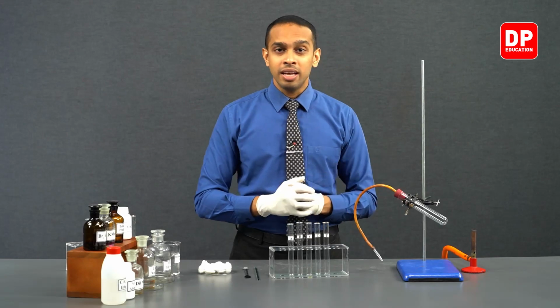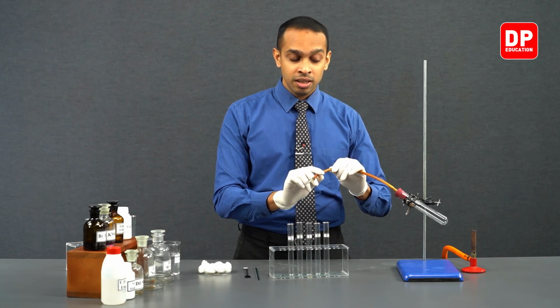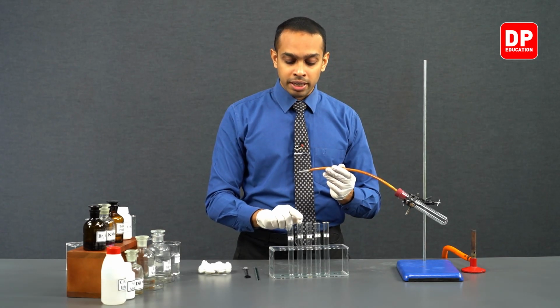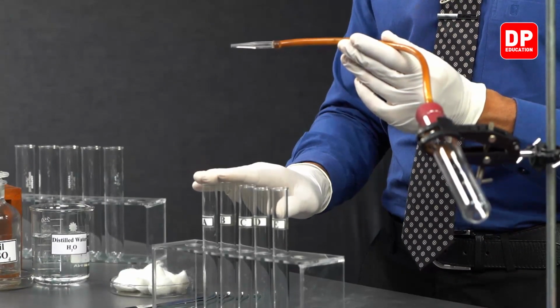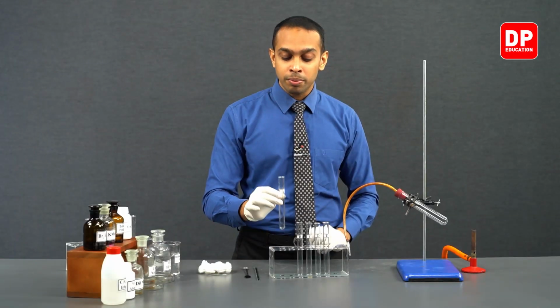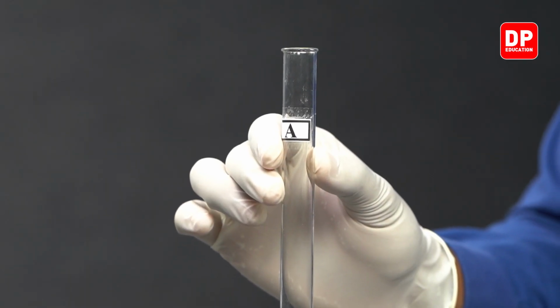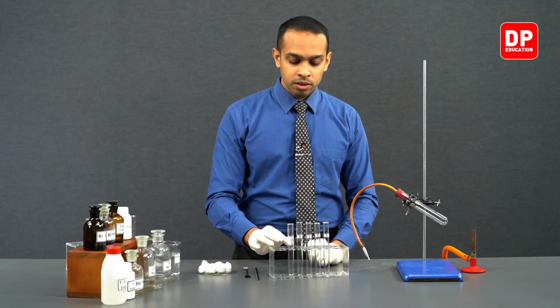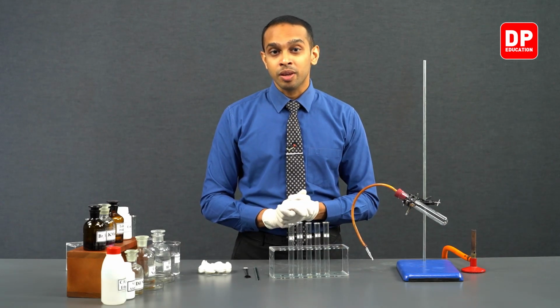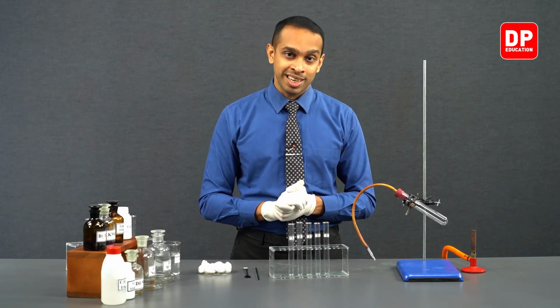When ethene gas is produced, it is going to be delivered with the help of a delivery tube that we have over here, and we will be taking different reagents into each of these labeled test tubes. To the test tube labeled A, we will be taking bromine water. To test tube B, we will be taking alkaline cold dilute potassium permanganate.